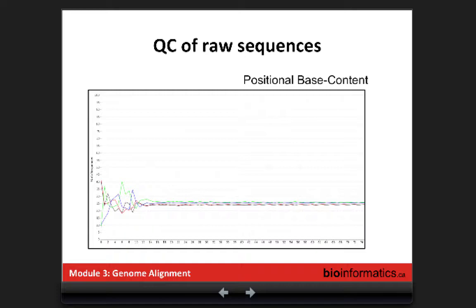For DNA, we don't have this type of pattern. It will be flat, but with two lines around 30 and two lines around 20. Is it the shearing problem? If it's shearing specific, then the RNA would have become DNA, right? You shear the cDNA, you don't shear the RNA. Yeah, but I think you shear at the beginning before doing the reverse transcription. And it's what Illumina explained on their forums about this pattern.